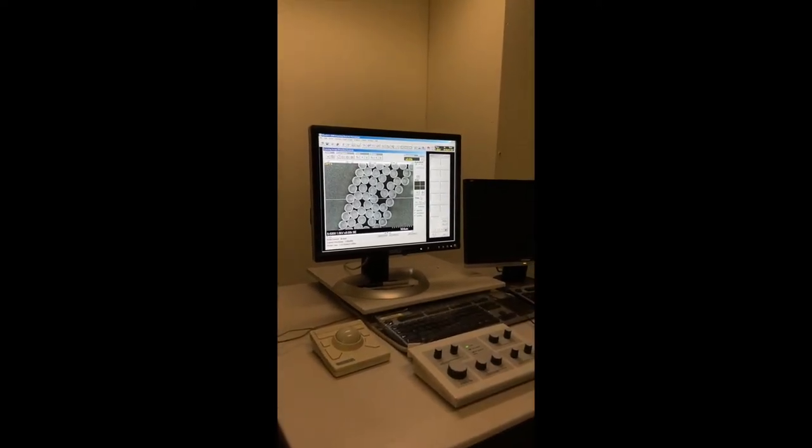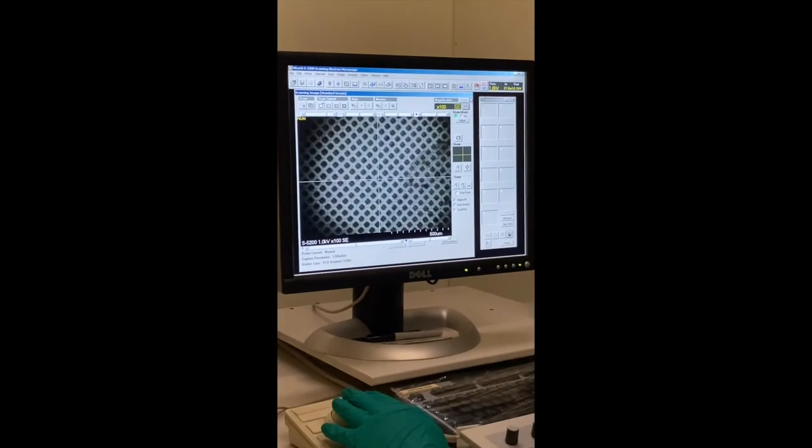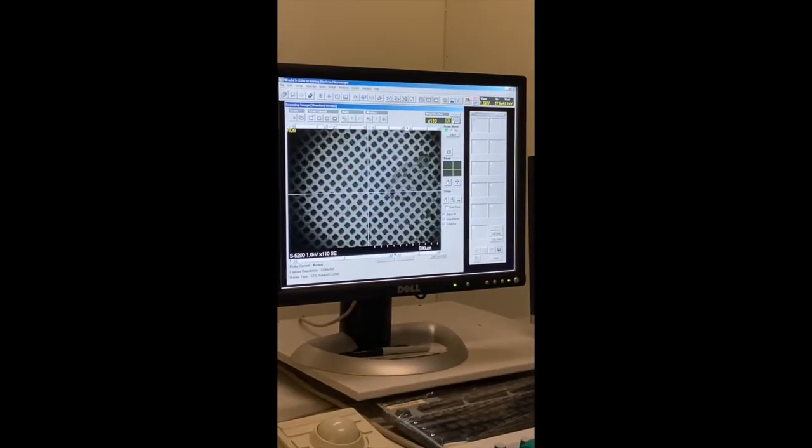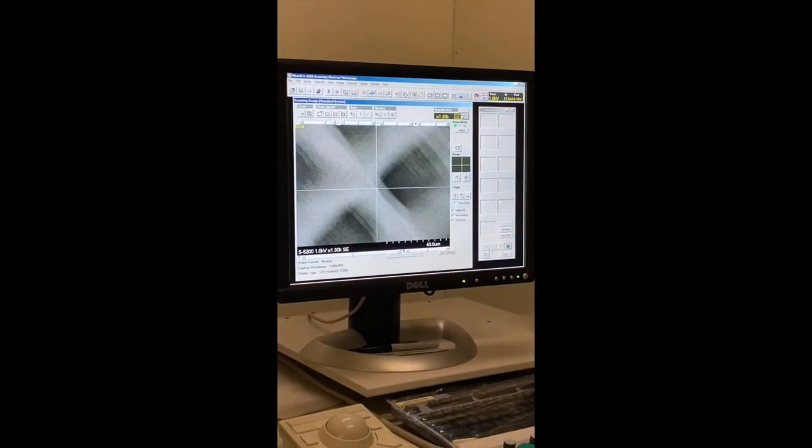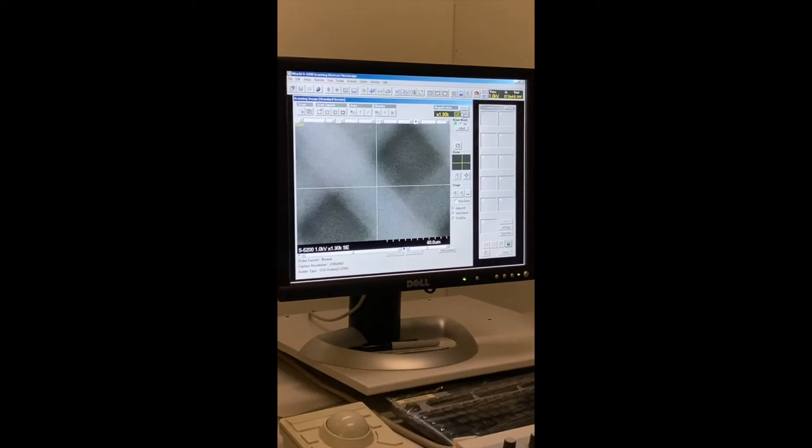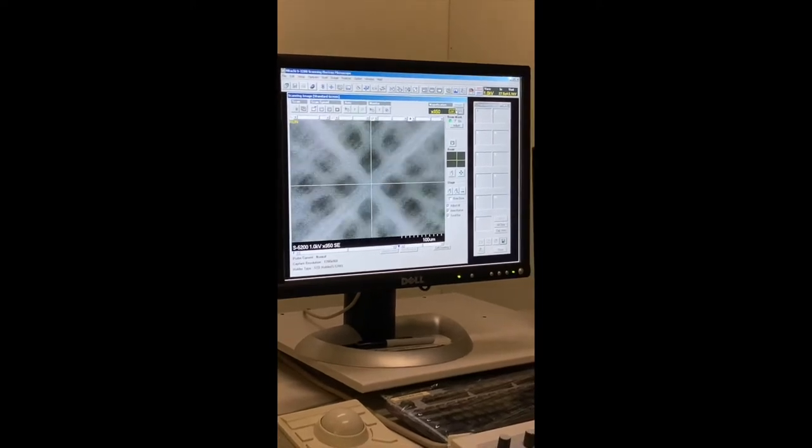So similarly to optical microscopy, we need to spend some time searching for our actual sample. If we made our solution properly dilute, there should be no more than a few hundred nanoparticles spread out on this grid. So they might take a little bit of time to find, but hopefully they're there.